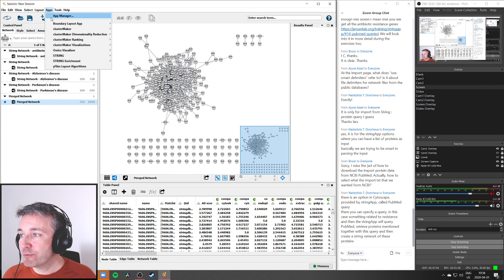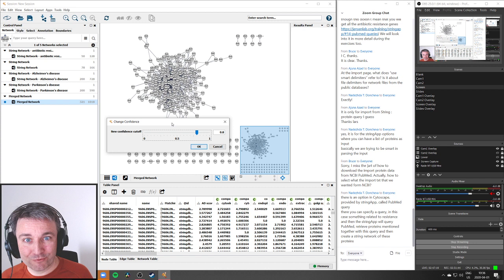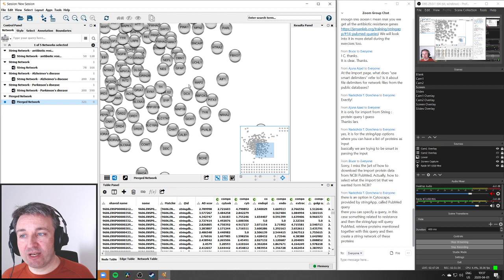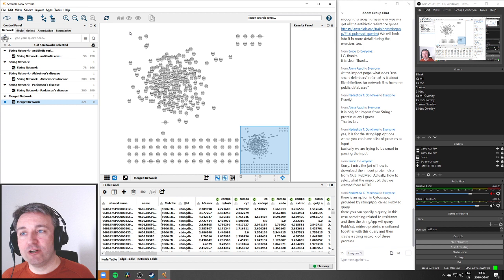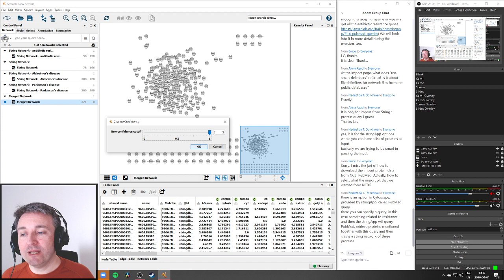STRING. Let me get a STRING network. First I'm just going to change the confidence, so you know how we set the confidence when we are importing a network. You can change the confidence afterwards. So what I'm going to do is first crank it up all the way. We're never 100% sure about anything, so I just deleted all the edges. And now, if I lower the confidence, the app will go back to the server and retrieve all of the interactions. So I can now retrieve interactions between them.